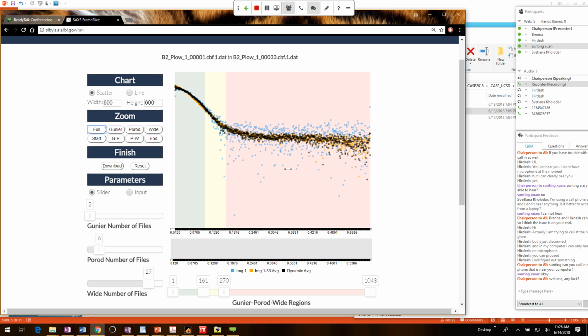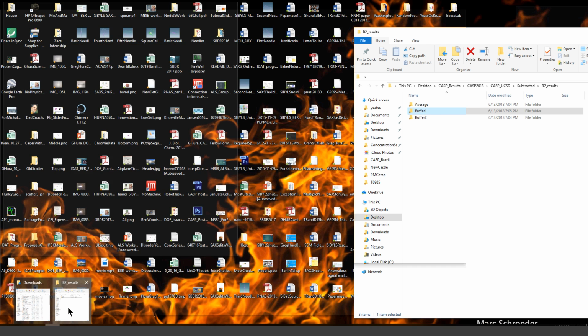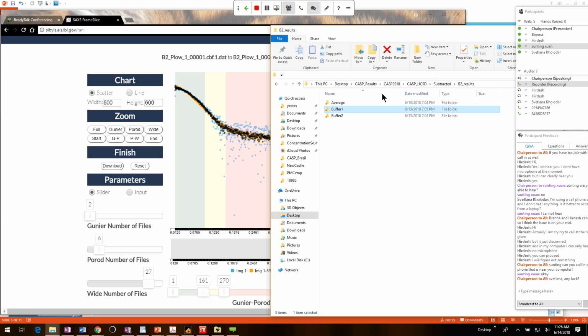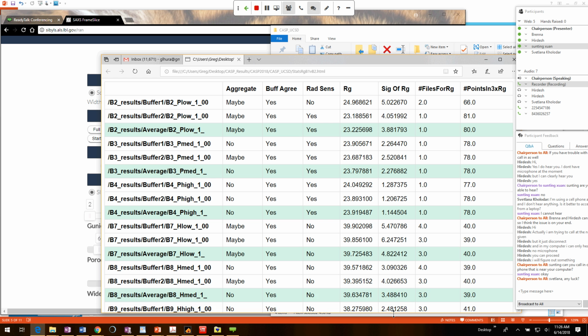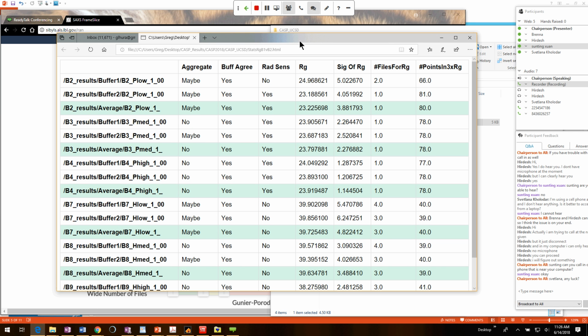All right. There is, in the package we sent you, some guidance on at least parts of this process. So, yeah. There's an automated script we created. And it's this stats RG B1 versus B2.html. So I'm going to click on that and open that up. And again, this is a totally automated script. I'm amazed that it's helpful. It's something I wrote. So again, take it all with a grain of salt. You're going to do this on your own, but it gives you some guidance.